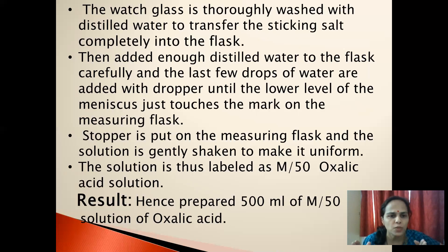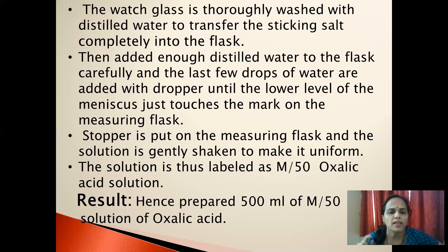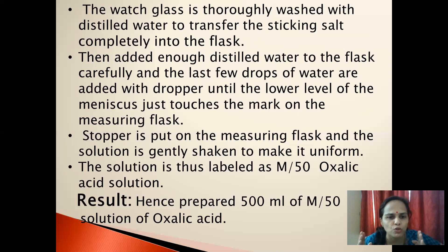The stopper is put on the measuring flask and the solution is gently shaken to make it uniform. The last point: the solution is thus labeled as M by 50 oxalic acid solution.